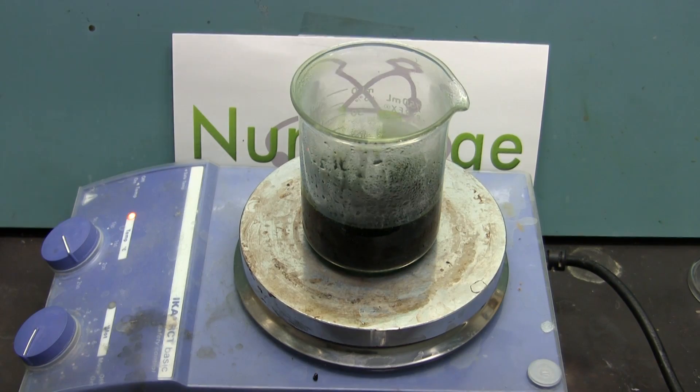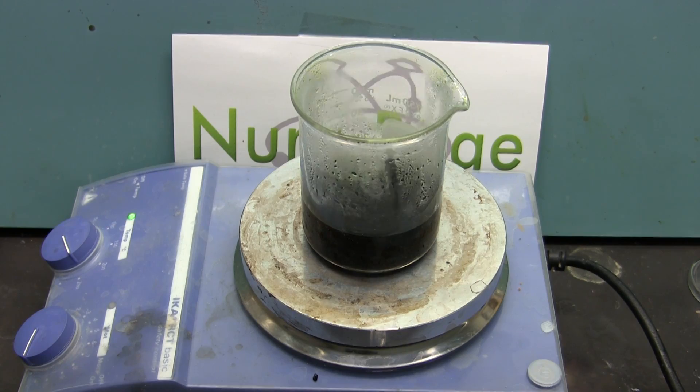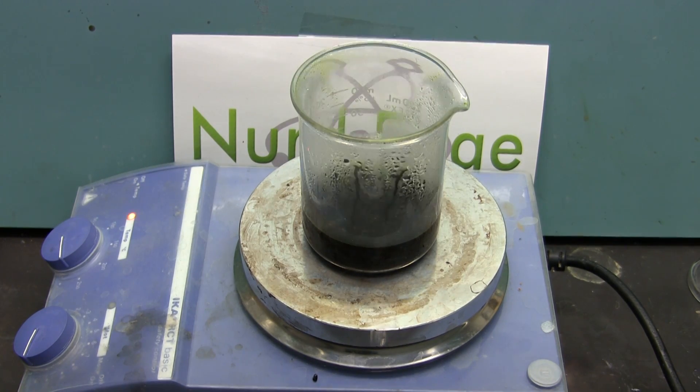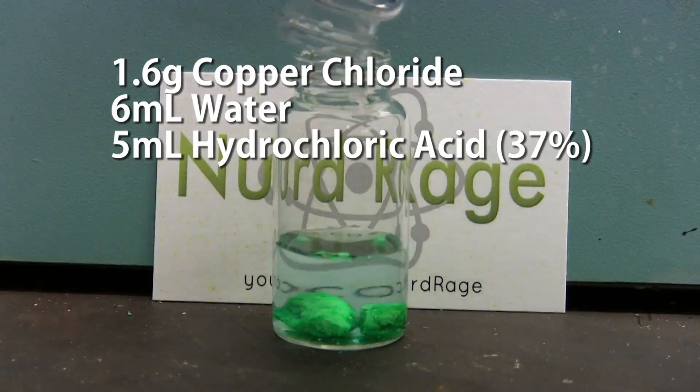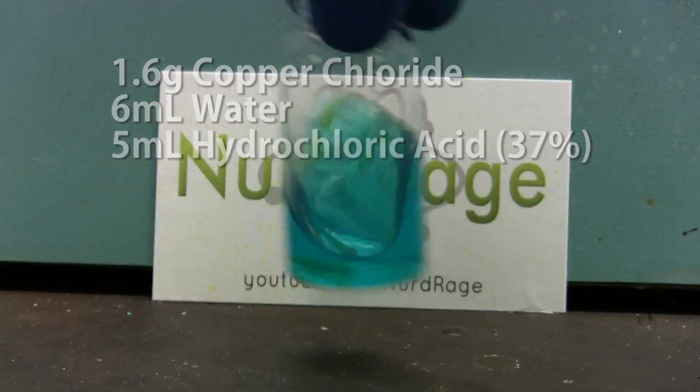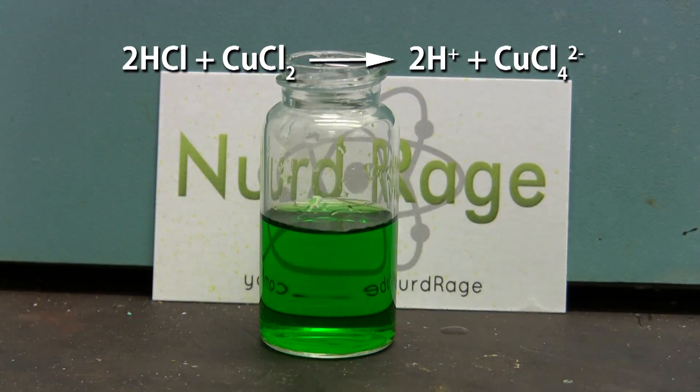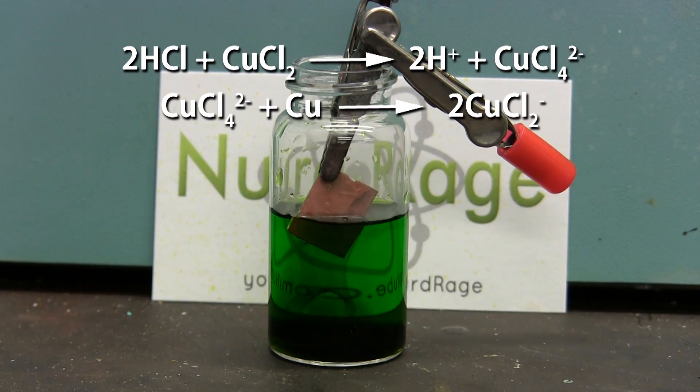The second metal chloride family etchant is copper chloride and hydrochloric acid. You can simply evaporate or boil down the spent peroxide and hydrochloric acid etchant from earlier into a highly concentrated solution or react fresh copper chloride with hydrochloric acid. The hydrochloric acid is necessary since it reacts with the copper chloride to make tetrachlorocopper ions. It is these ions that react with copper and can disproportionate into dichlorocopper ions.